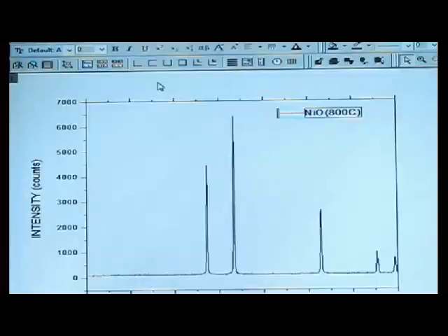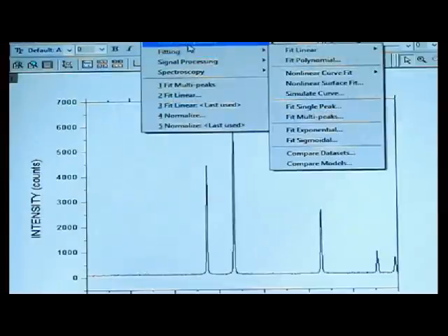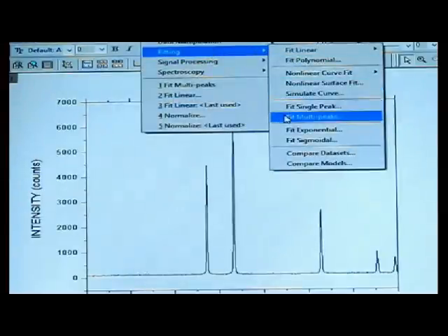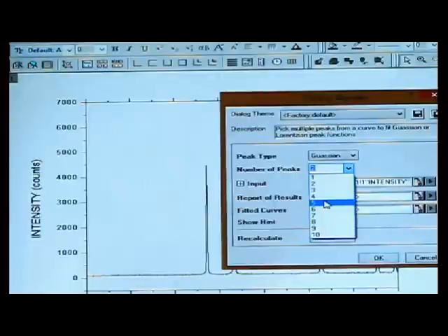At first, we have to identify the peaks. So we click on the analysis menu bar, go to peaks, then go to fit multi peaks. Here we should give the number of peaks. Since there are 5 peaks on the curve, we have given it as 5. Then click on OK.